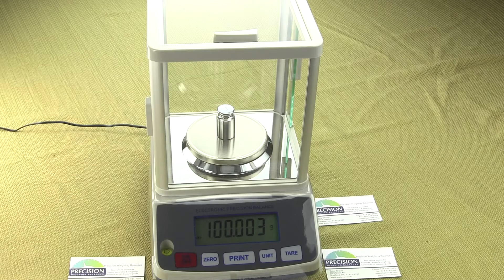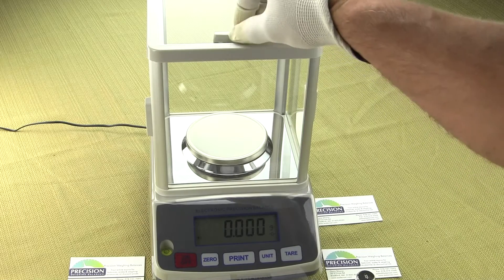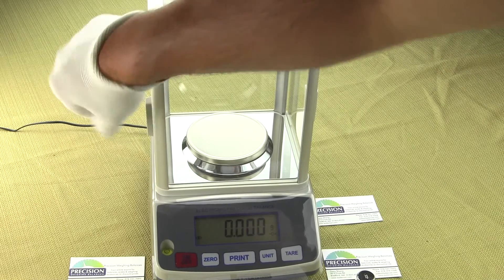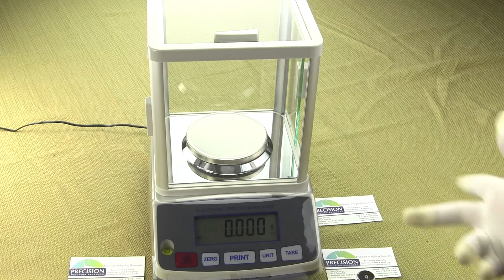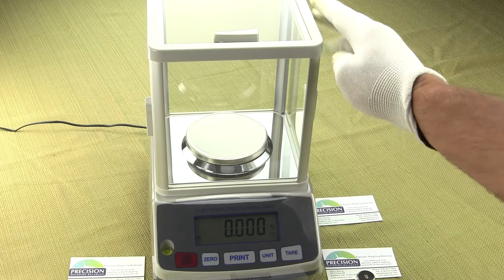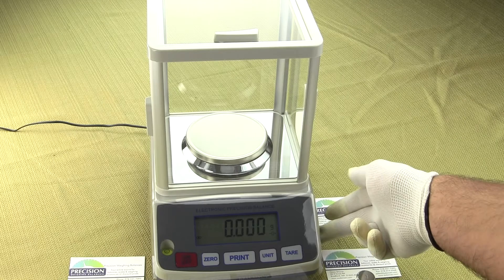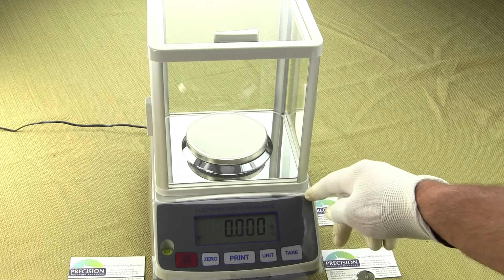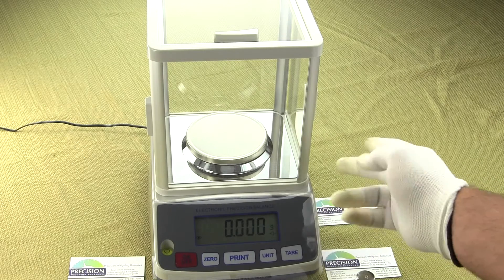Some other features on this model: we have an all-glass draft shield. Most comparable models in this category from other manufacturers would have a plastic draft shield. This is a three-door glass draft shield where you can open it from the top, the left, or the right side. The opening on the side gives you up to almost 4.5 inches. The draft shield is not removable — it's a permanent draft shield. The scale also comes with a plastic splash guard that's permanently affixed to the balance.